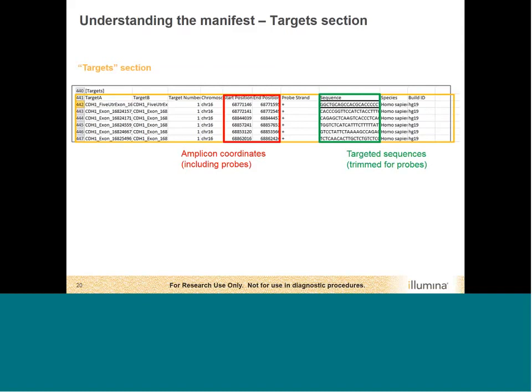You have to keep in mind that our probes are hybridizing. They are not created by synthesis. So that part cannot be used for variant calling. So it's only the portion in between that is key to finding your sequence variant. Here we have our ULSO, DLSO ID combination. Those are unique names that are given to the probes that we can use later for the analysis. And then here we have the strand to which read1 maps.